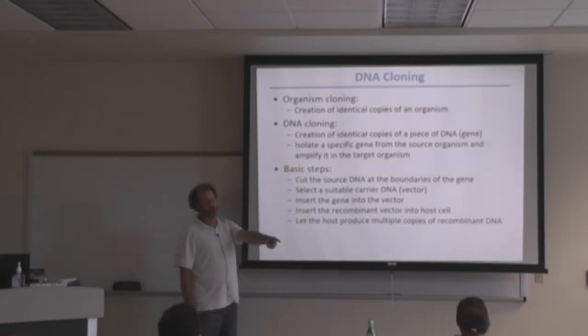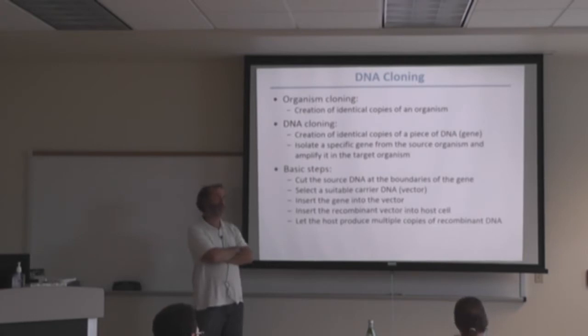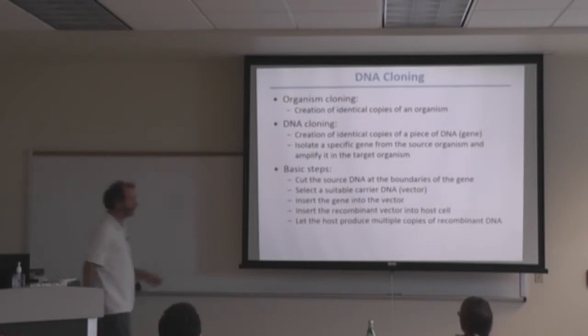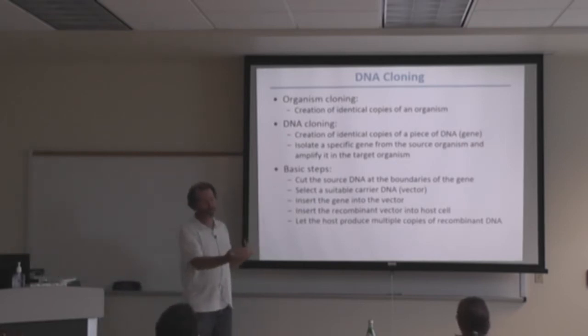So do you know what gene you're isolating? GAPDH gene. Do you know what GAP DH stands for? Glyceraldehyde 3-phosphate dehydrogenase, GAPDH. That's an enzyme that's part of the metabolism section, glycolysis, which will be the next section, not this test. It's known as a housekeeping gene because all organisms express it, normally at fairly constant levels, so a lot of people use GAPDH and actin as controls to monitor the expression of the genes that you're trying to extract experimentally.